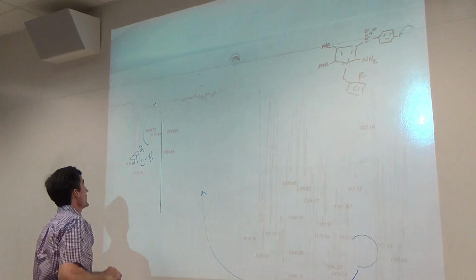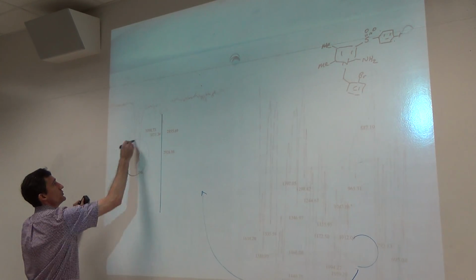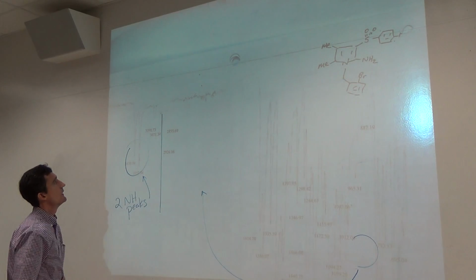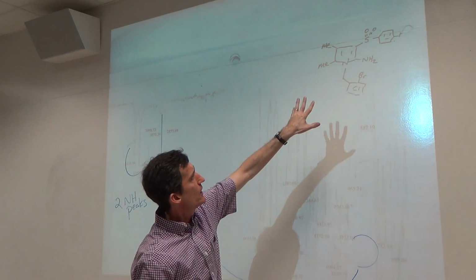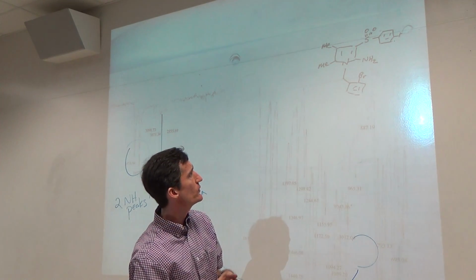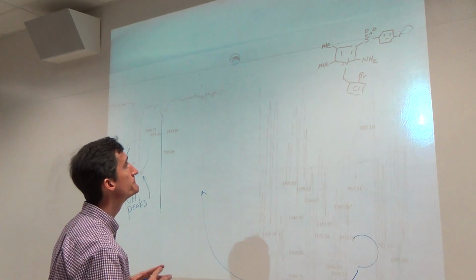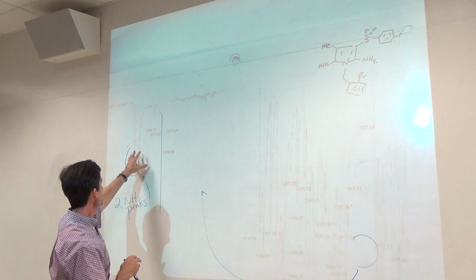Over here in the NH region, we have these two NH peaks. We have the CH region here. Your S double bond O, that's actually fingerprint, even though it is double bonds, because the sulfur is heavier than a carbon. But let's focus on this.